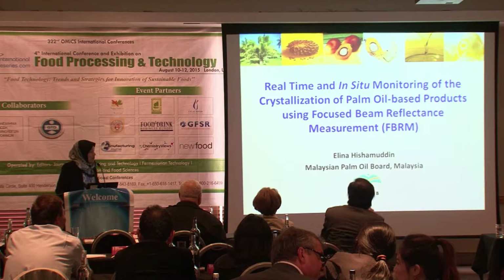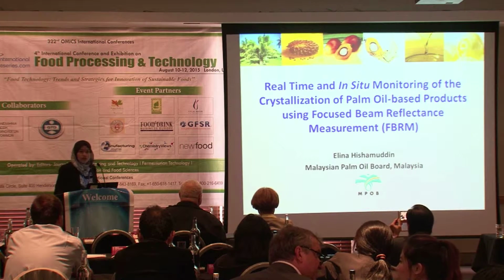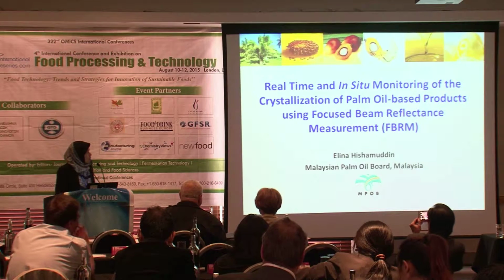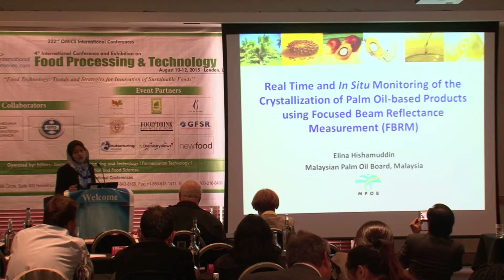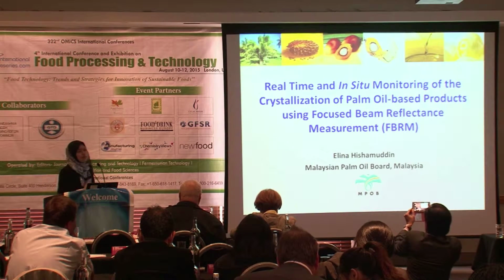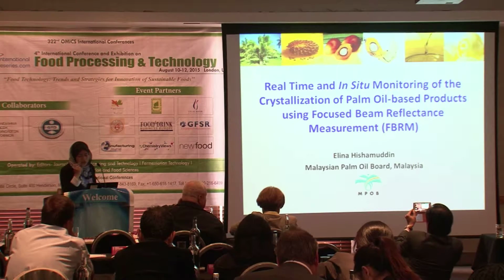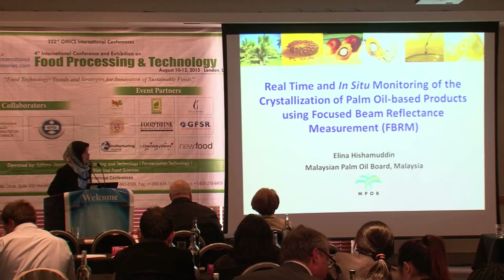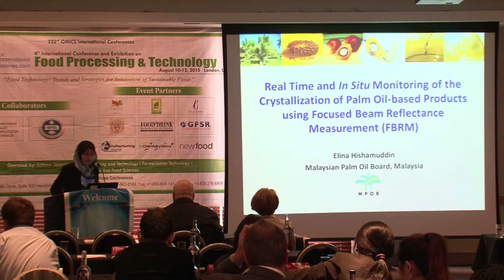Okay, so I am Elina, and I'm from the Malaysian Palm Oil Board in Malaysia. And today I will be talking about a review of studies that have been done on real-time and in situ monitoring of crystallization of palm oil-based products using the Focused Beam Reflectance Measurement.